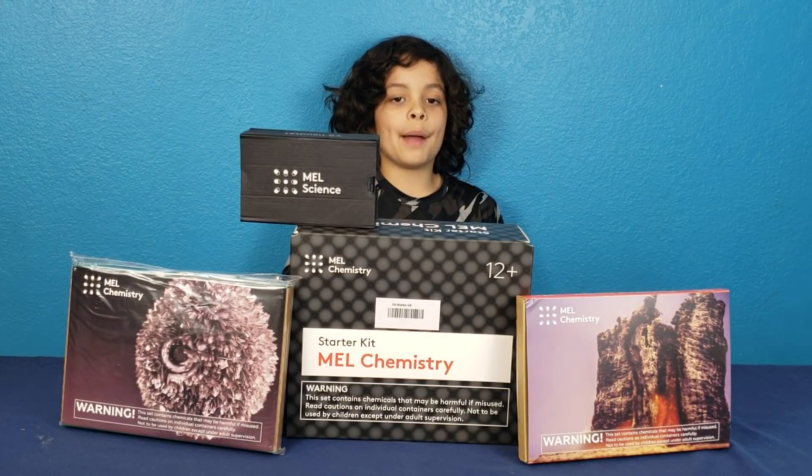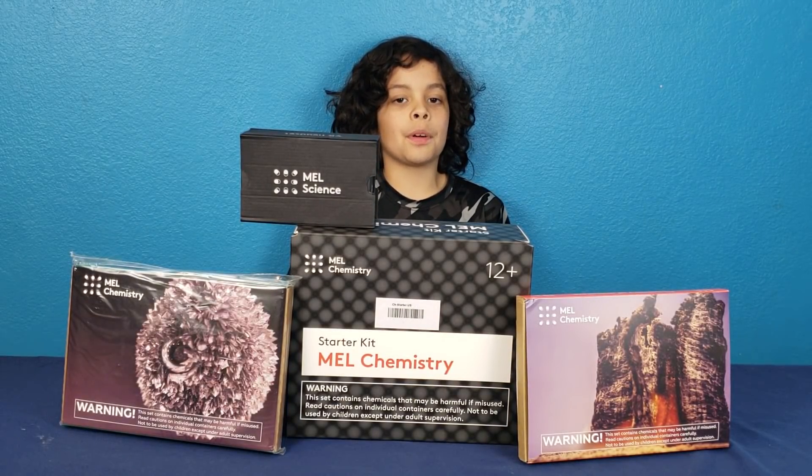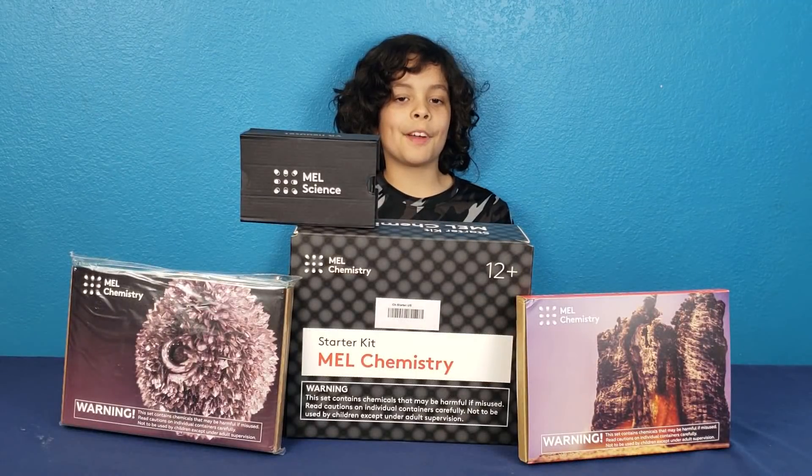We'd like to thank MelScience for sending us this product. Hi everybody at SuperFamilyFun, I'm Xavier and today we're going to be reviewing MelScience.